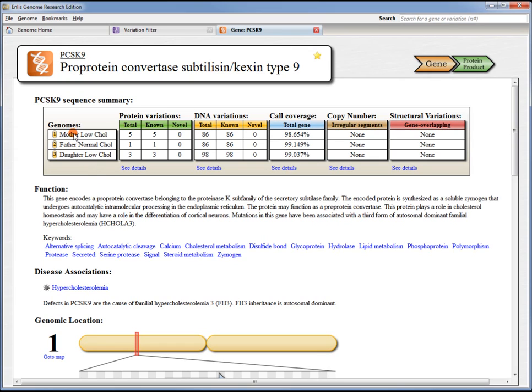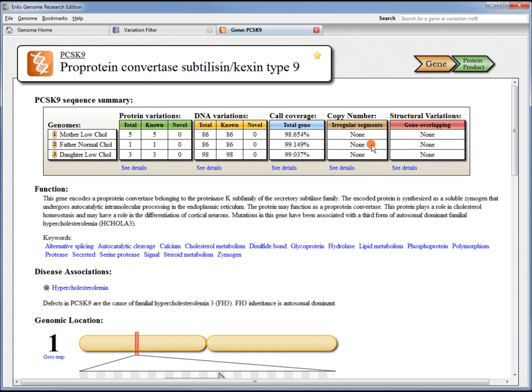Here are the mother, the father, and the daughter. And then we have summaries of their protein variations, DNA level variations, call coverage, and any overlapping copy number or structural variations. For each of these sections, there's more details further on down the page.